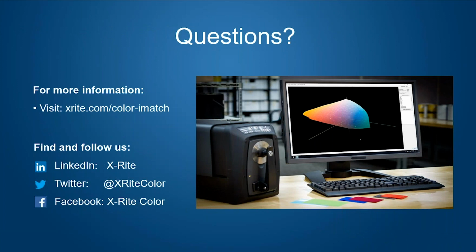Thanks, Rich. Yes, if you haven't submitted a question yet, feel free to do so now. It looks like we already have a few questions coming in, so we'll get started. First question: how does the Multiflux engine improve the predictions of translucent plastics?